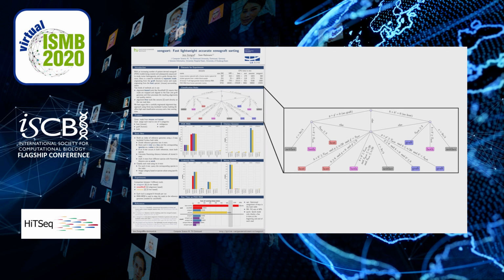If we have no graft or weak graft, we can't assign it to the graft category, and if we have no host or weak host, it can't be host. The problem is, most of the time, we have a mix of these values. We have some weak graft and some host k-mers, and we have to decide, okay, it's host or it's graft, and to do this, we empirically derived thresholds and formalized them in the decision tree you see here.